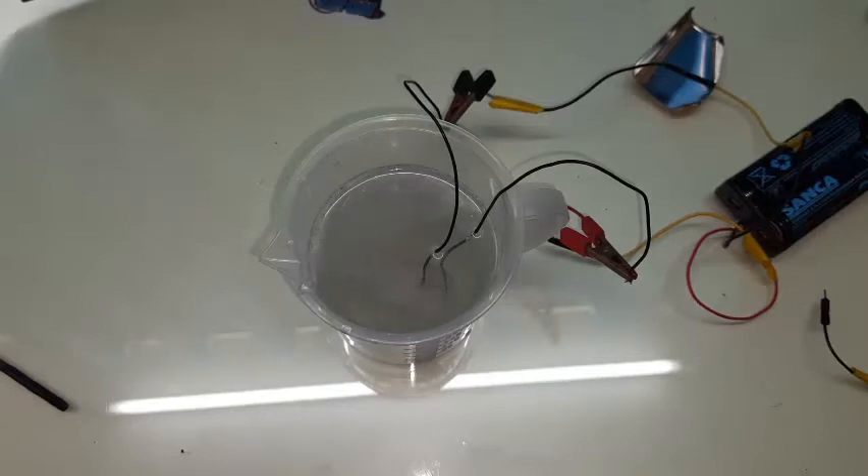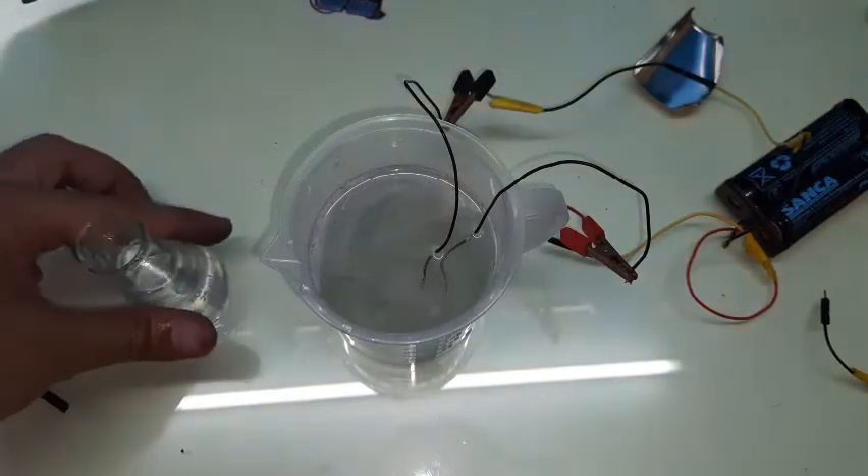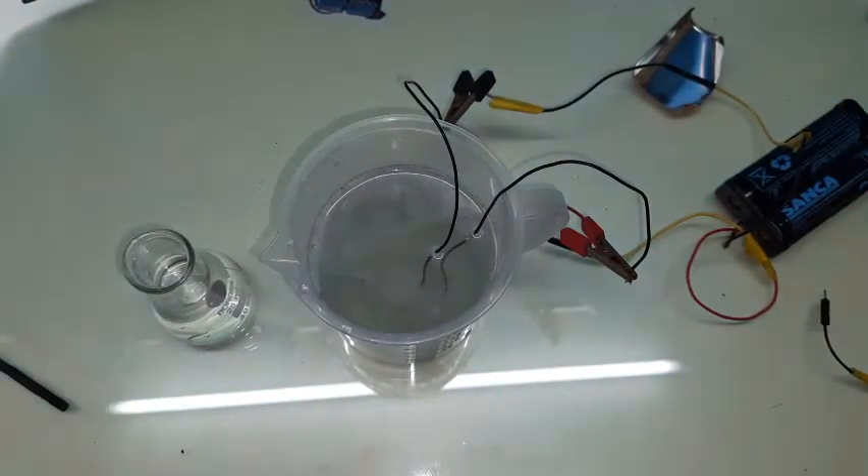Our solution is brewing right now — you can see the bubbles coming up. You will see some sediments depending on your salt: if your salt has impurities, more sediments show up; if your salt is pure, fewer sediments appear. I've taken some solution into a separate beaker for testing.